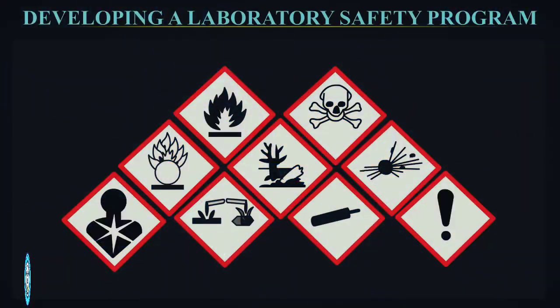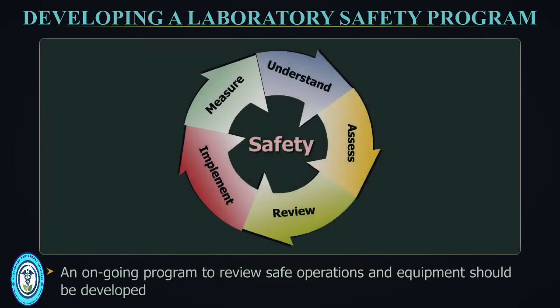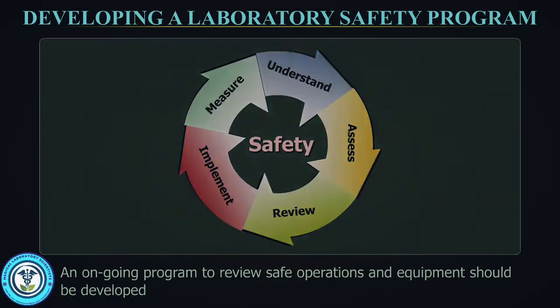Developing a laboratory safety program. Developing a lab safety program is equally the responsibility of the management and the technical authorities. An ongoing program to review safe operations and equipment should be developed.